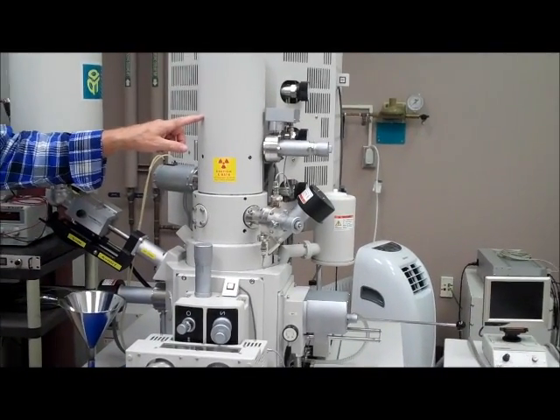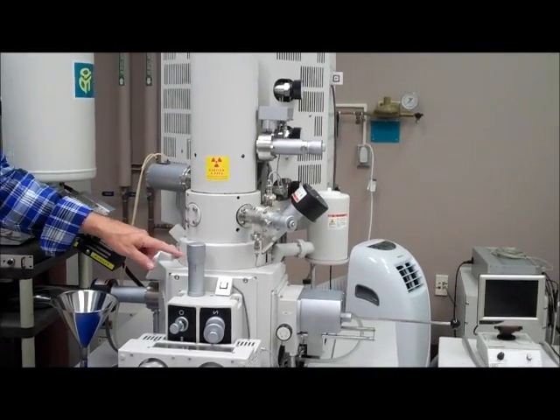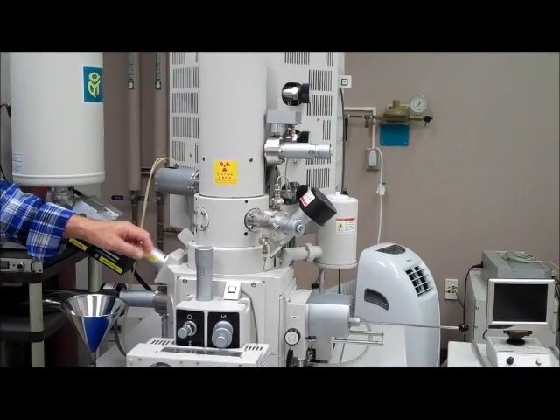One of them is called a condenser lens, which is at the top. And then there's an objective or focusing lens directly above the sample.